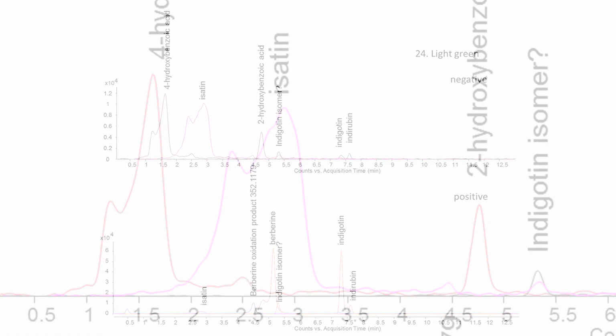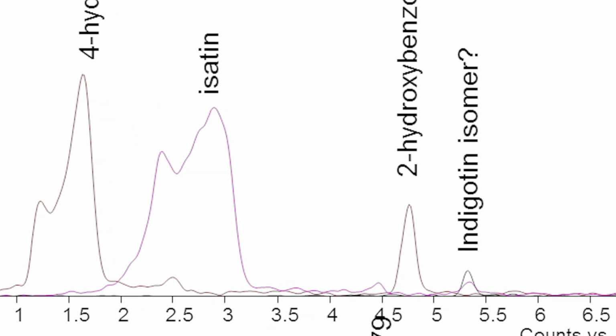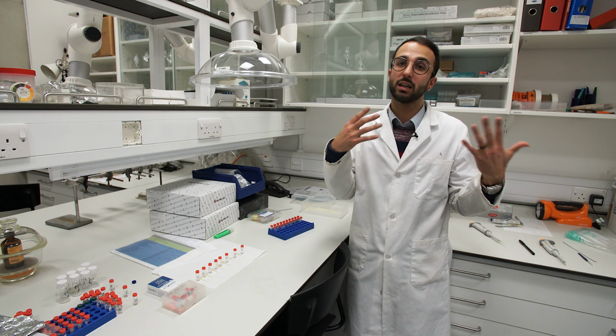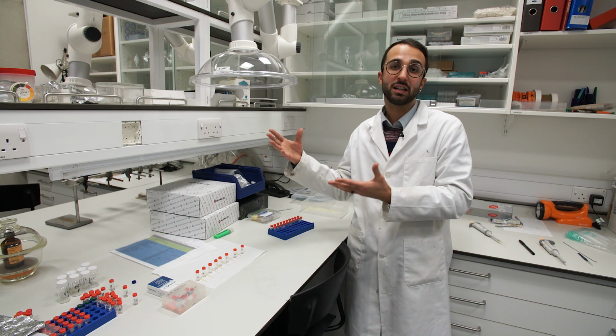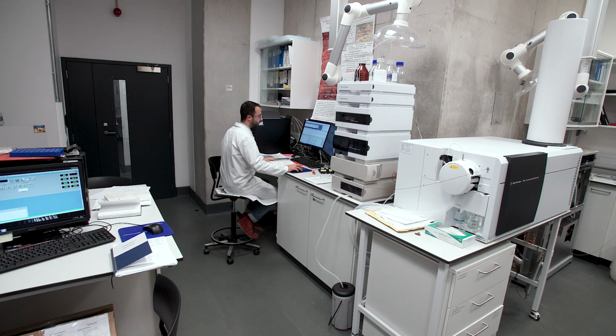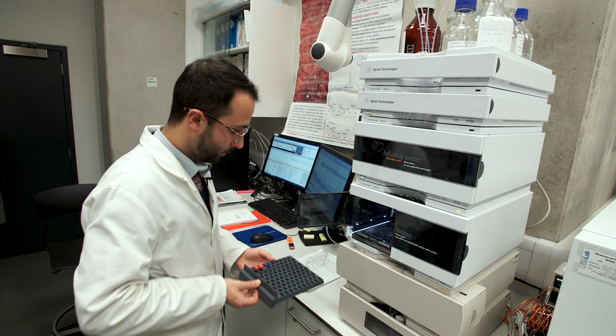And by doing that, I will be able to say, okay, this red is made up of madder rather than cochineal, or this yellow is made up of the extract from this plant rather than this other plant. So these are all the information that I can get from these results.